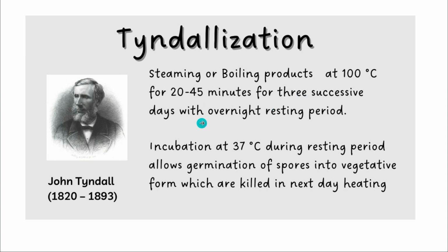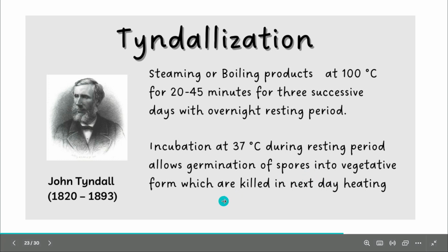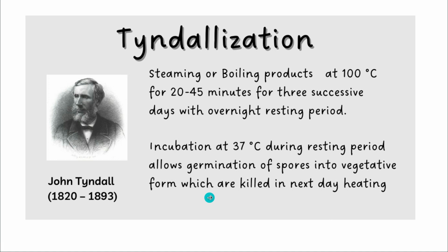The incubation at 37 degrees during the resting period allows germination of spores into vegetative form. Then the next day when you practice this steaming process, these vegetative forms will be killed.